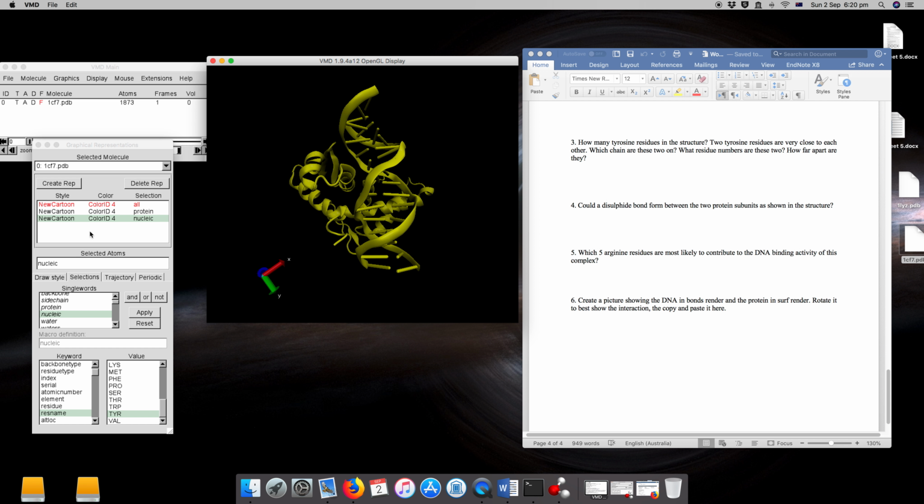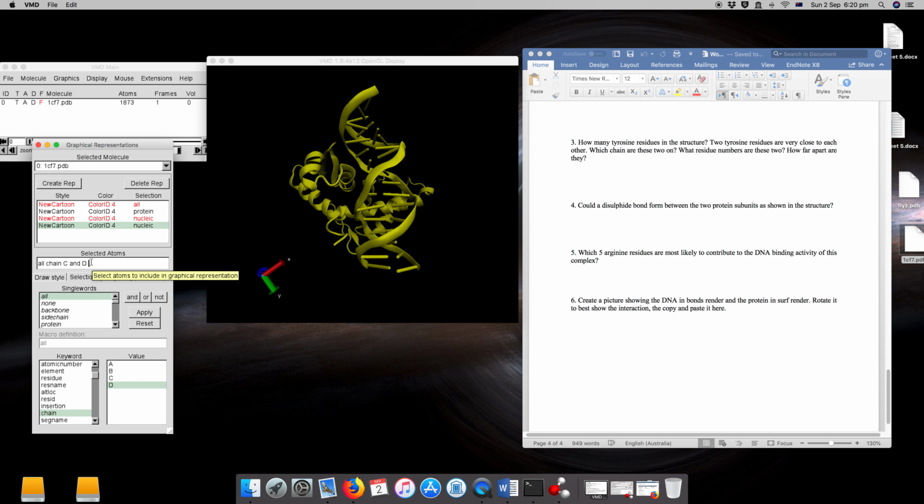So if I deactivate this, create a new, we can go all and find chain, and we want chain C and chain D. You can do them together or one just to show you that it can be individually.